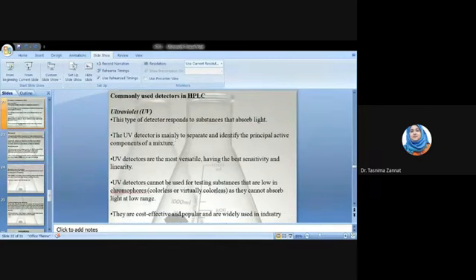At first, UV detector. UV detector can separate and identify the components, and this UV detector is most popular because of its cost effective, কারণ এটা হচ্ছে একটু দামে সস্তা, যার কারণে বেশিরভাগ কোম্পানিগুলা কিন্তু এই ডিটেক্টরটা ইউজ করে to separate or to detect the simple mixture, but it has the limitation, it cannot detect the colorless components.